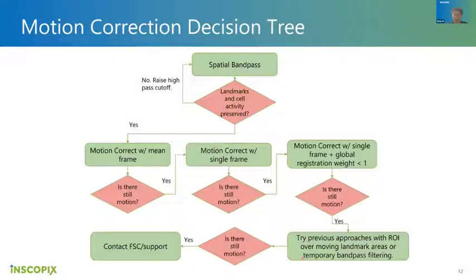And as I said, the ROI is typically important when you have a lot of motion within the lens, and we can usually use it whenever we see that. So yeah, it may not help in every case, since in a certain brain area close to the ventricle zone, if we have built-in motion, we have to think about how to improve that at the surgery step instead of the post-processing.